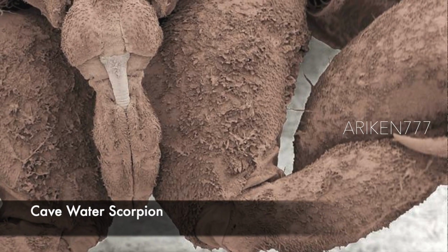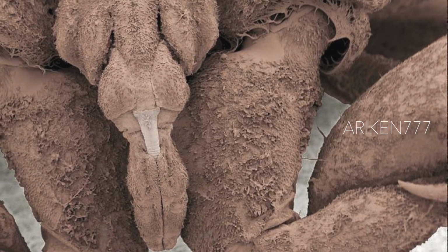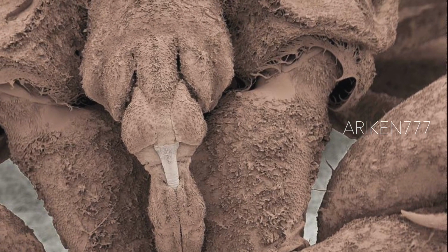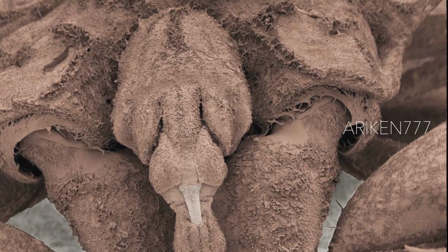A cave water scorpion found only in the caves in Romania, where life has been cut off from the outside for at least 5.5 million years. It has evolved in total darkness over that time and has lost its eyes as a result. At center are its piercing mouth parts it uses on its prey.